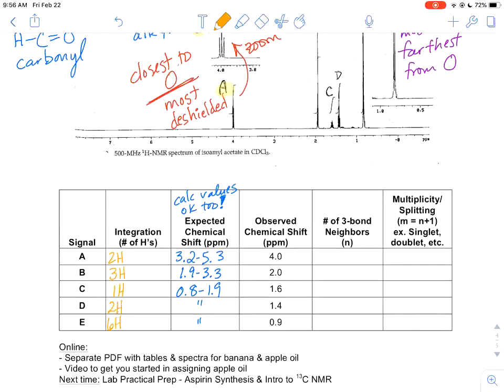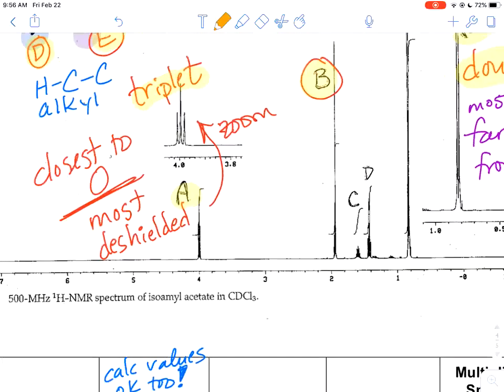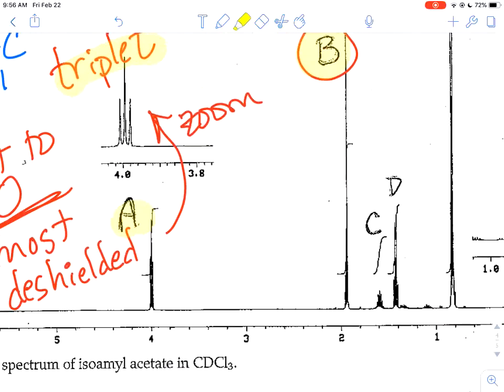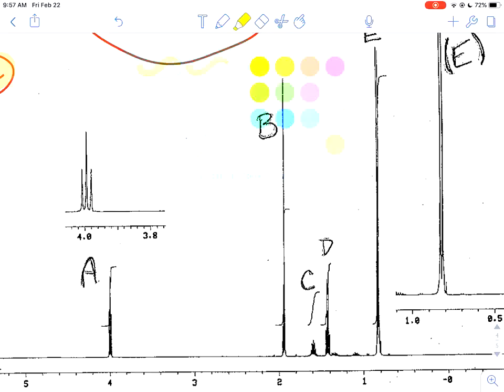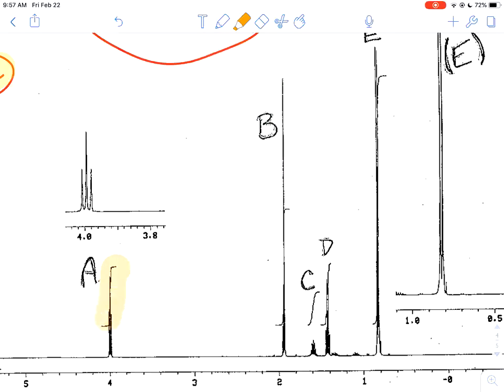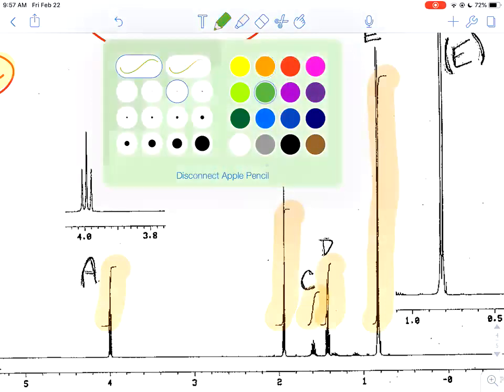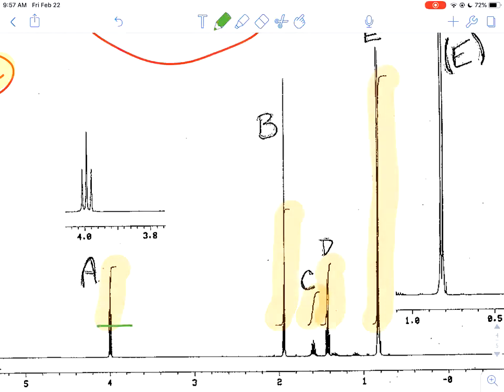But really what the integration is, is the area under the curve. It's not the peak height. It's actually, I'm going to highlight. So actually I'm going to erase some stuff real quick and then I'll come back. There's a cleaned up version. What we're specifically looking at is that little area. You can see these little squiggles. Those are the integration lines. And if we have the paper version, which I have separately, you can measure the height of each of those. And so you would go from here to here, from here to here, here to here, there.